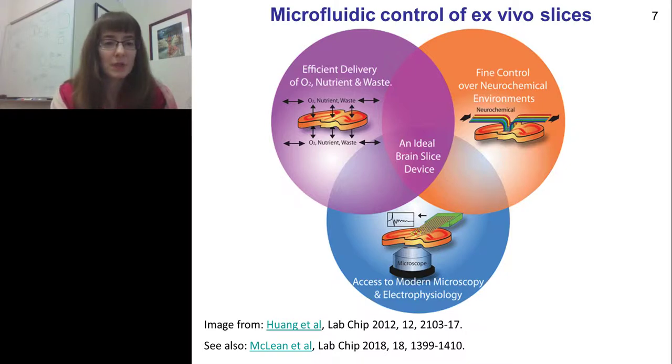And microfluidics engineers quickly figured out that by using fluidic control at the microscale, they could more efficiently control nutrient and waste exchange, and they could control the gas environment around the tissue, often in a way that was more controlled than in classic cell culture dishes.